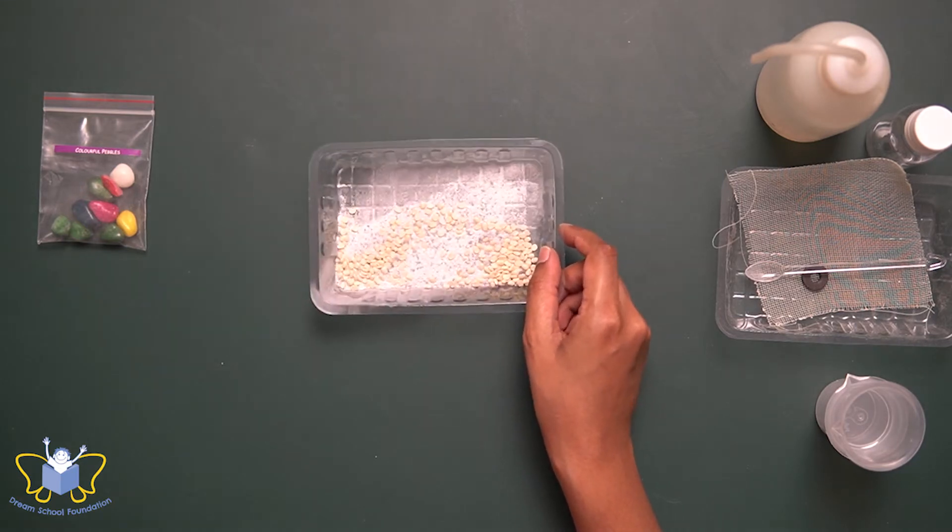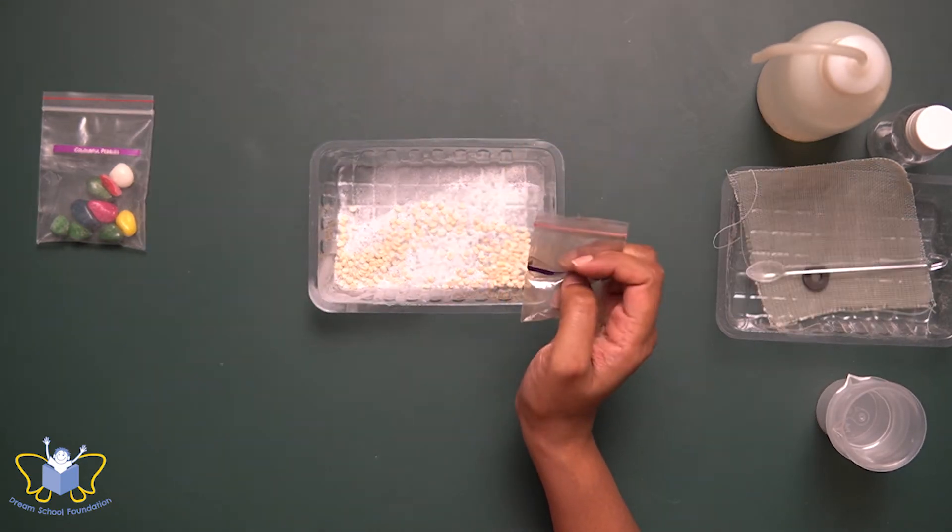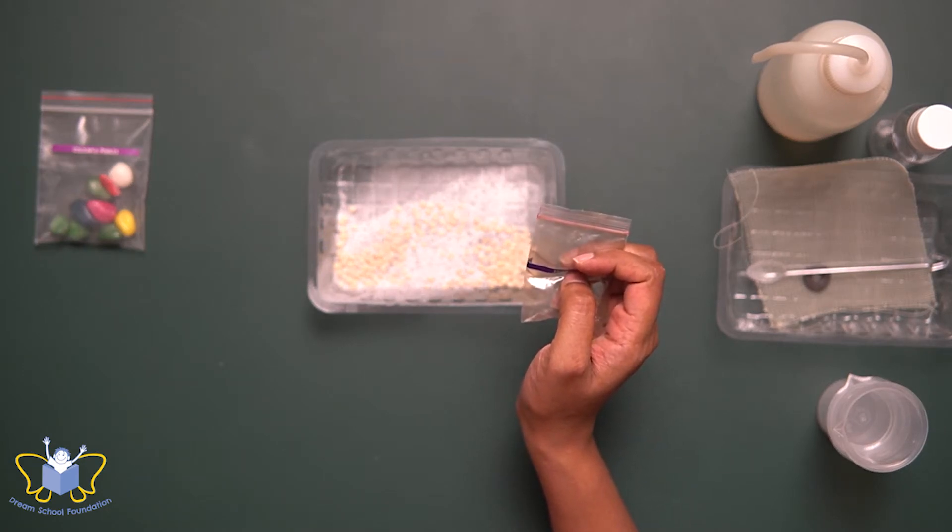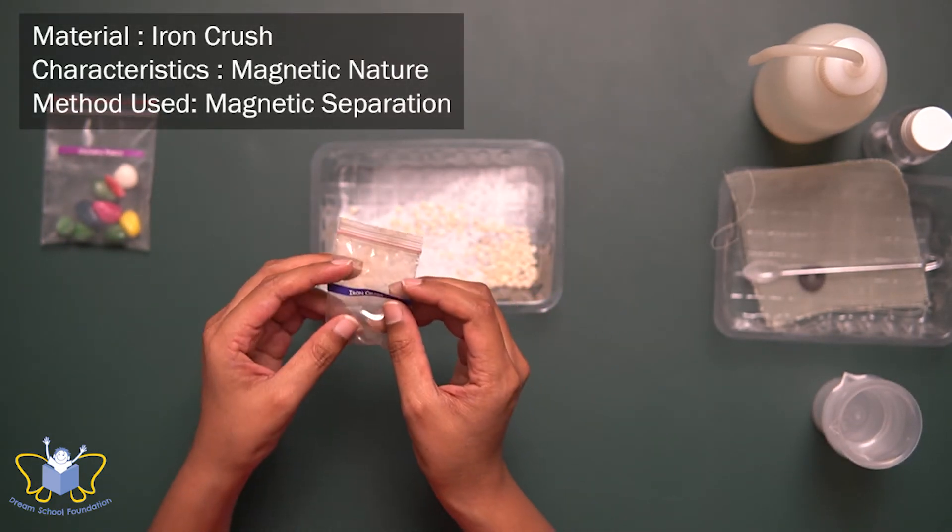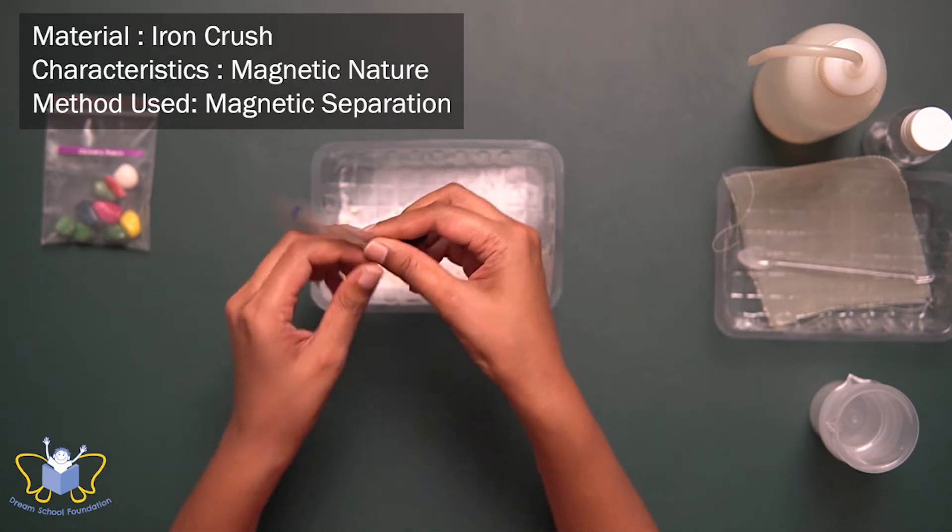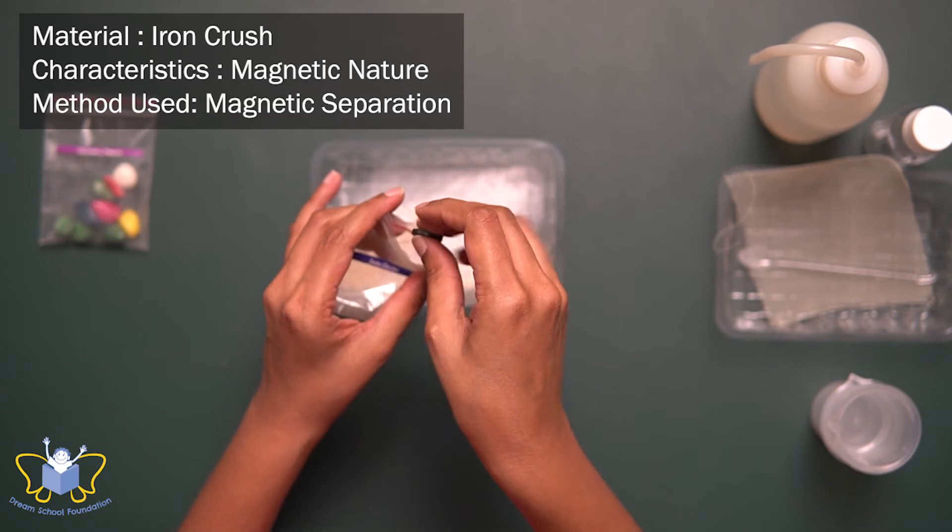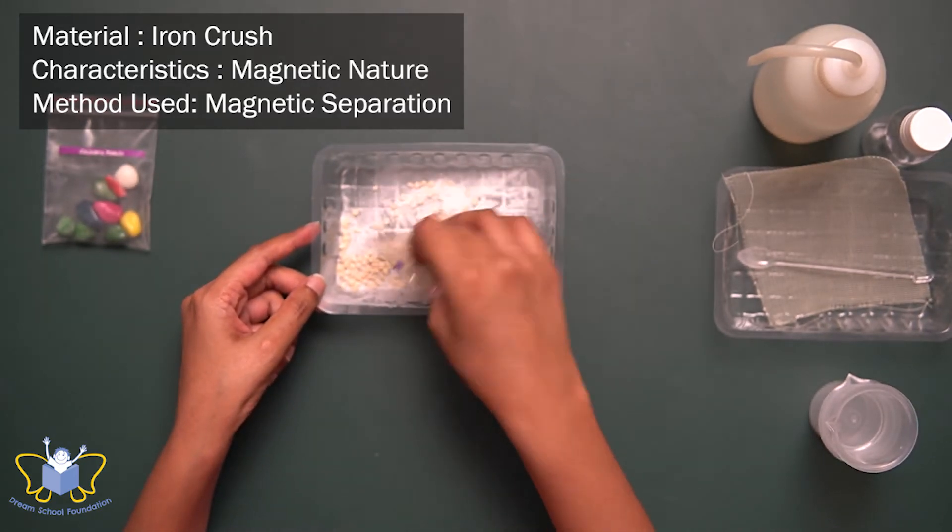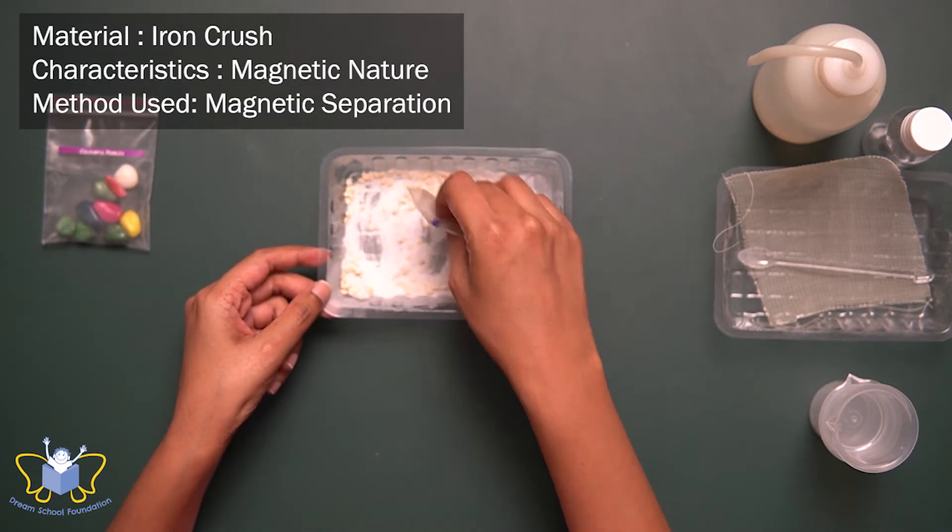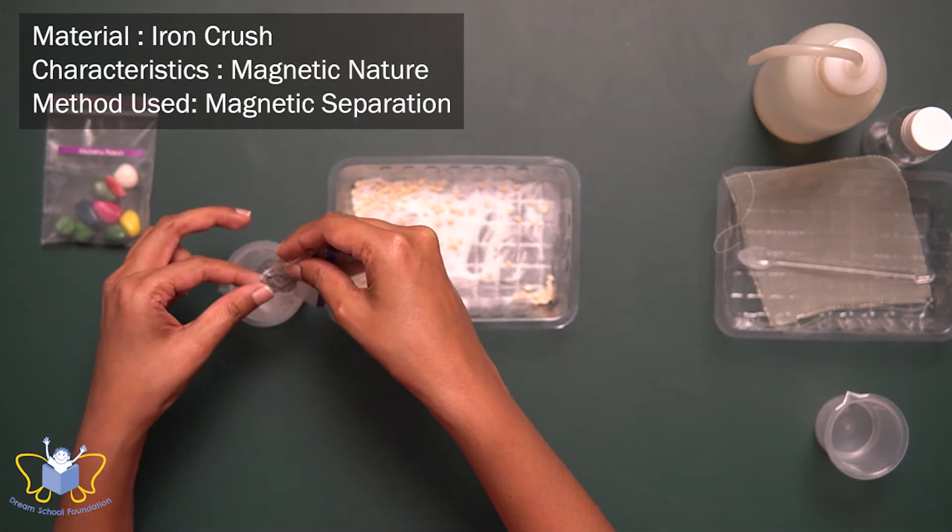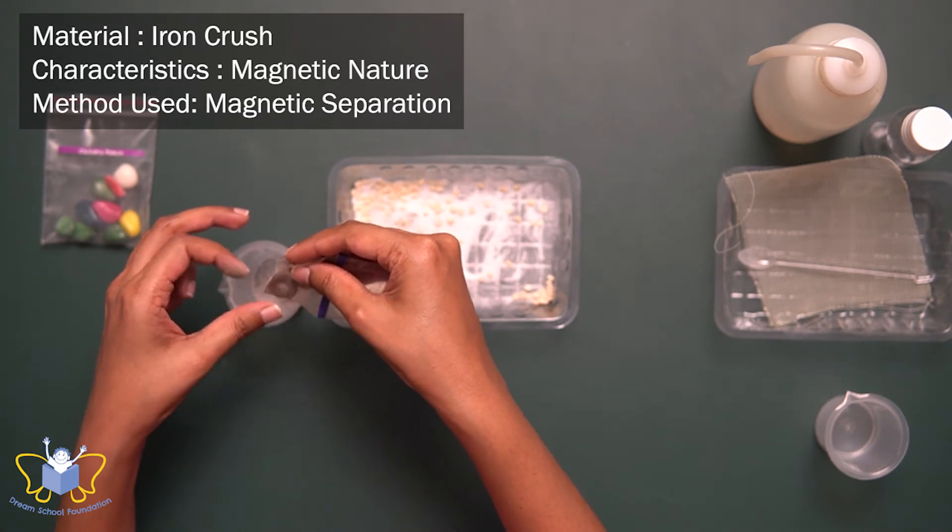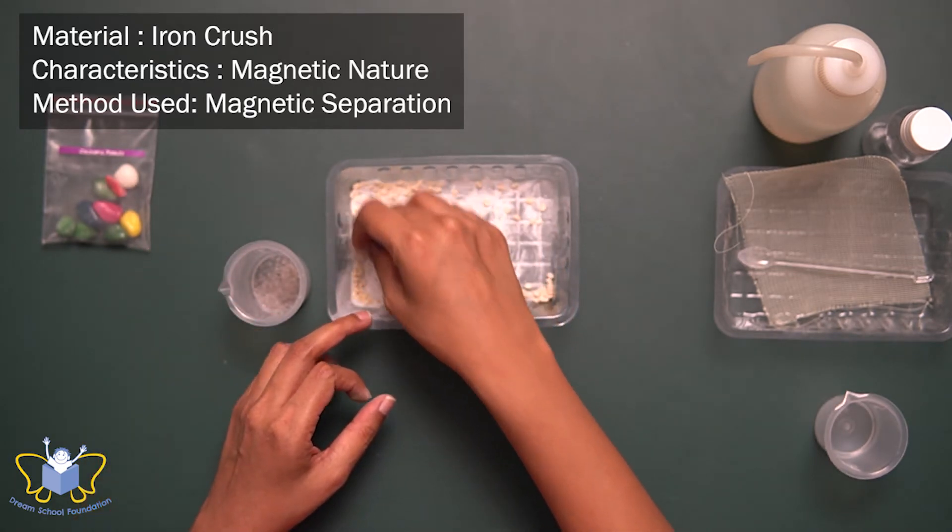So what do I separate next? I did add iron crush, right? And we are aware that iron is magnetic in nature, correct? Whereas the other substances are not. So whenever we are selecting a characteristic, we need to make sure that the other components do not have the same characteristic. As being magnetic is very unique to iron, I'm going to use a magnet to separate the iron crush. I'm going to put it in a ziplock cover so that it's easier to separate later on. Here you can see the iron crush separated from the mixture.